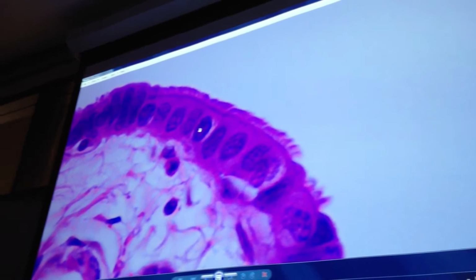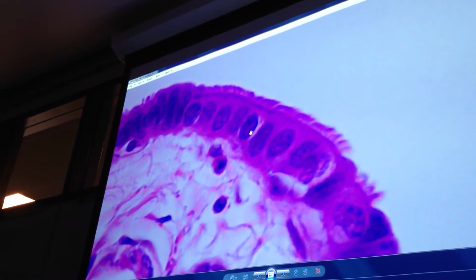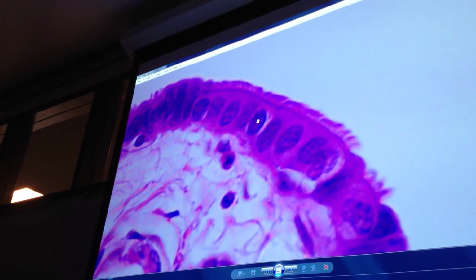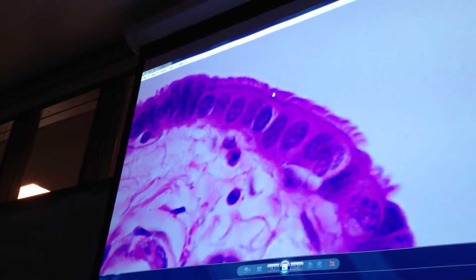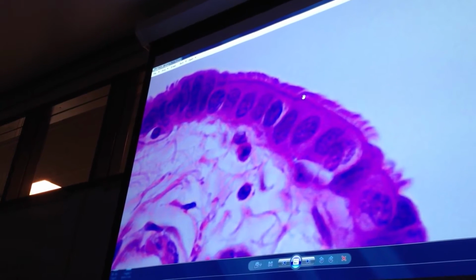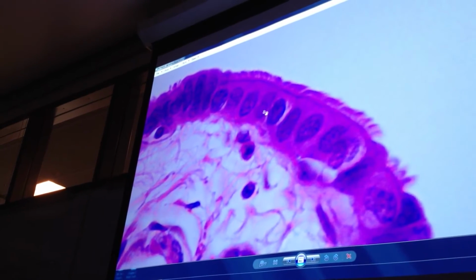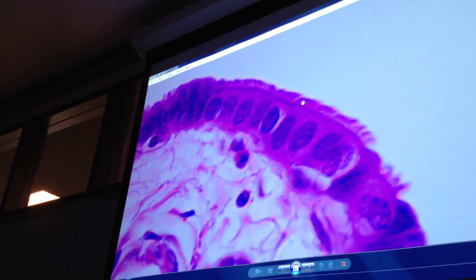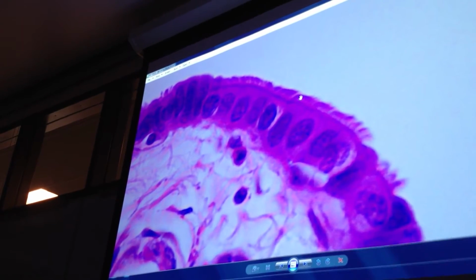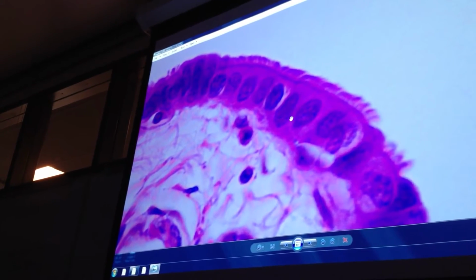Now if I asked you three words that name that epithelium, what are those three words? Columnar, simple, ciliated. Those are columnar, not cuboidal? Those are, that one right there. Are those microvilli? They're cilia. Remember, microvilli are much smaller, they're shorter. No.